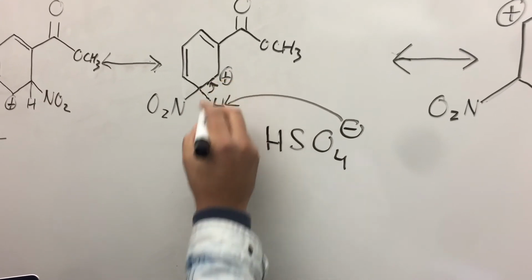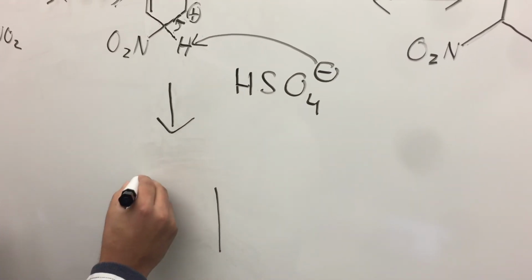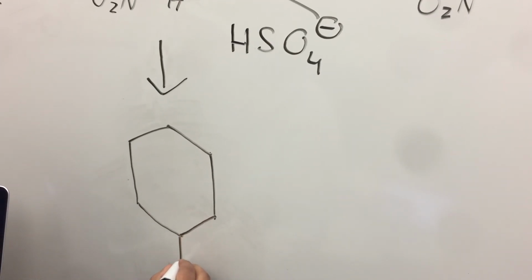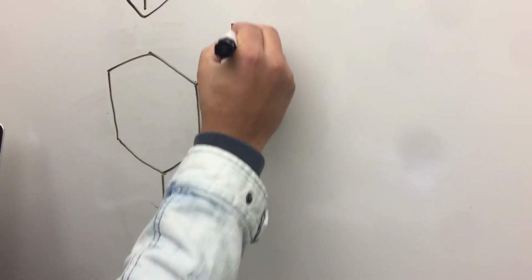is carried out. For instance, the meta-nitromethyl benzoate product, which is being drawn here, forms in a majority of cases because its position in the benzene ring is that of the greatest electron density. The structure of the molecule attached to the benzene ring will determine this region of greatest electron density.